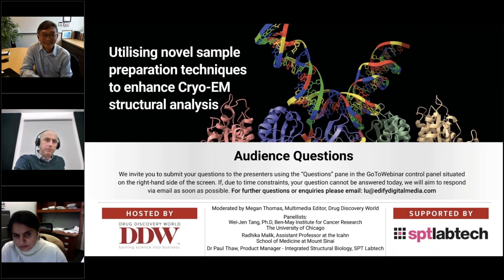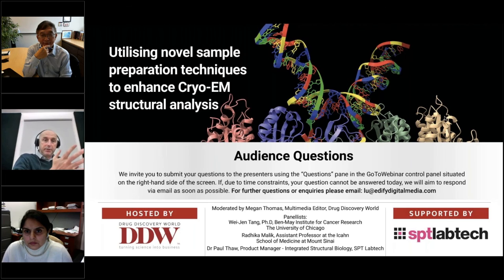I hope that helps. No, I think it's very good advice. So do you see a future where the way forward is to bring the vitrification process, through whatever means, closer to the biochemistry? You've talked about taking samples literally off the end of a column, which is an extreme view, but do you see a model where you freeze the sample straight off the column, vitrify it, and then use a remote microscope, almost like the FedEx approach we've used in crystallography for many years? Do you see that becoming more prevalent?